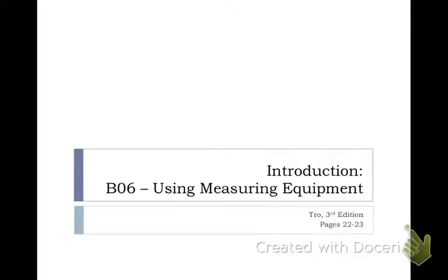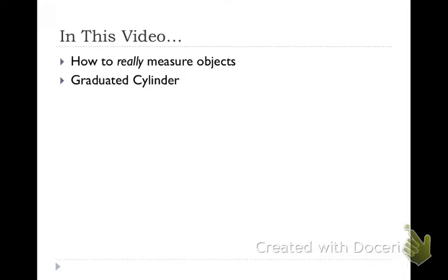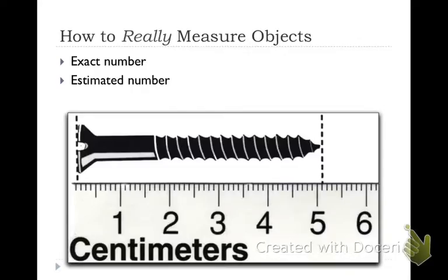Everyone, so this is a 6th little video dealing with measurements. And we're actually going to show you how to use measuring equipment, and this is pages 22 to 23 in your textbook. So we're going to talk about how to really measure objects and look at some graduated cylinders.